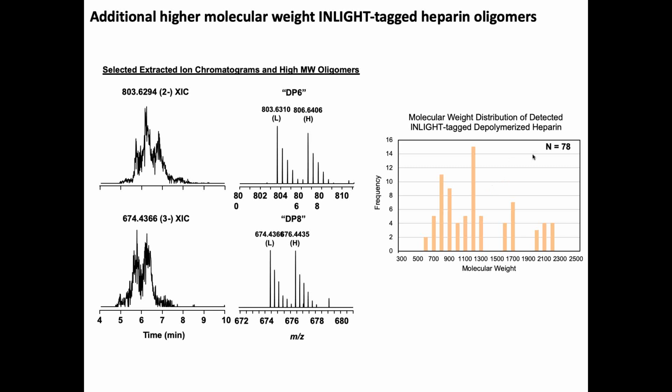So I think that you have a very large spectrum of options available that you never want to close your mind to. You never want to be of the standpoint of, I'm going to get everything I need out of this mass spec measurement. There's a lot of cool stuff you can do with the enzymatic, chemical, just general intuition.